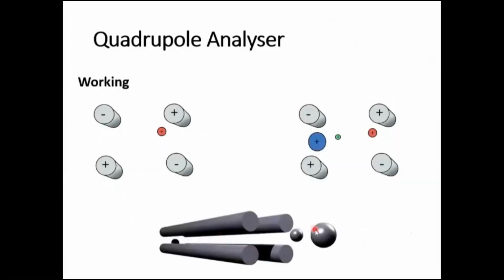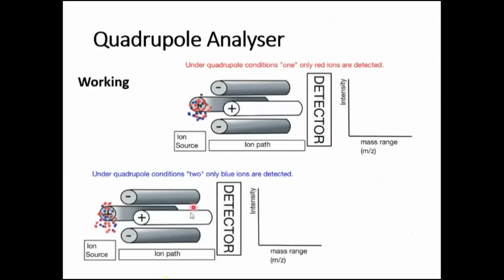So this is what I was talking about. You can see the animation over here. Actually, these images were also animations. I don't know why they are not working. See, the right weight molecule passed, this one got neutralized and this one escaped. Observe these two animations.